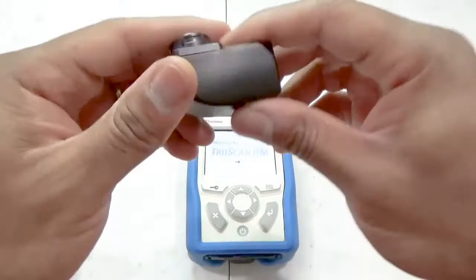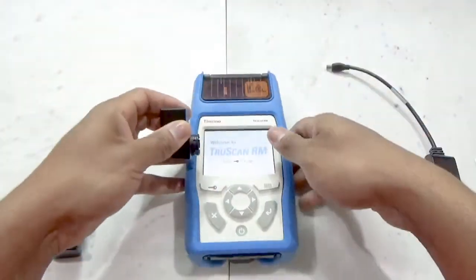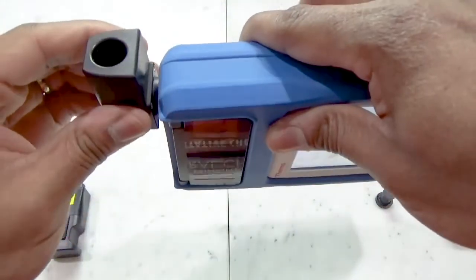This is the vial holder. It accepts typical 4 milliliter vials, and just like both nose cones, the vial holder can easily snap on and off.